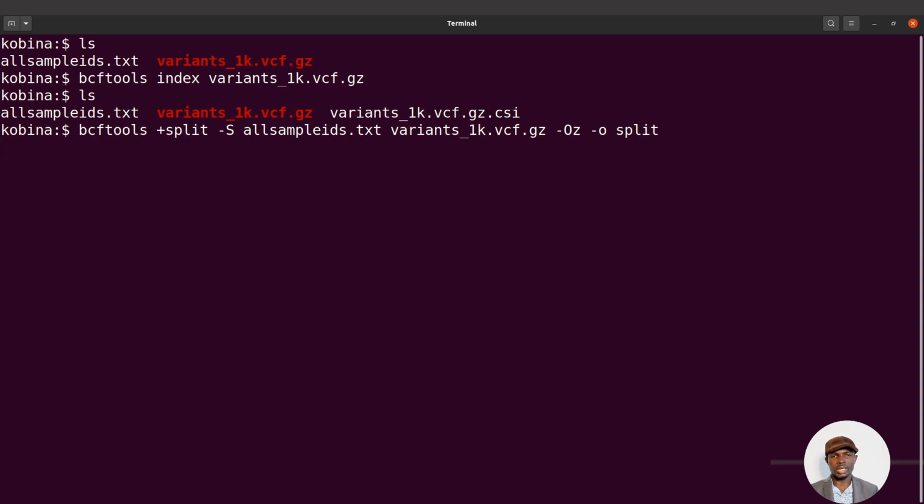All right. So it's working now. It should take roughly a minute or less, so let's wait for everything to get done for us. Okay, so the variants have been extracted for us.